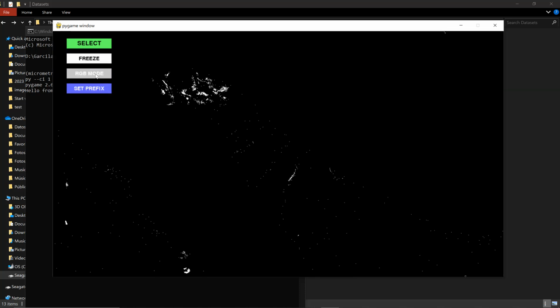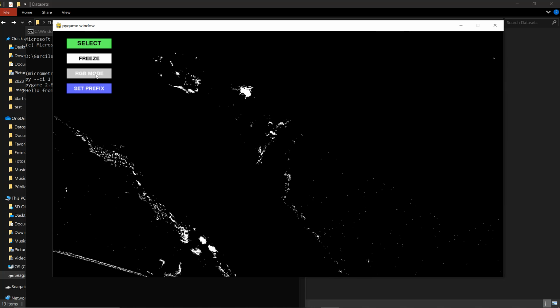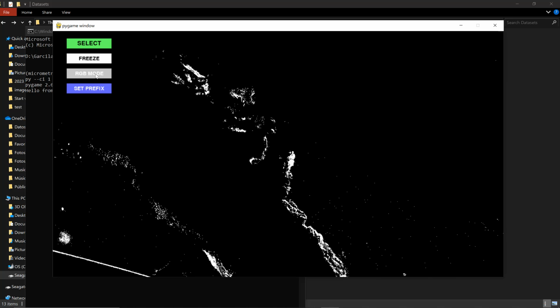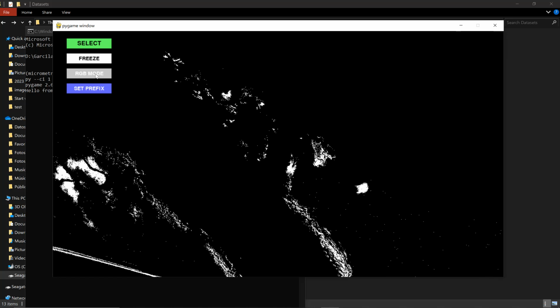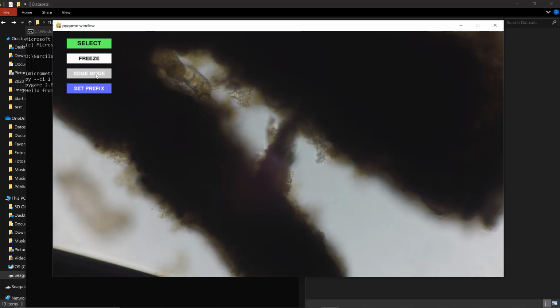And we also have the edge or motion detection parameter, which allows us to highlight the elements against the background based on a quantification or an average of pixels that reveal a static background. Regardless of how you decide to train your neural networks, whether it is with halftones, which already provides only one channel, although you would need to flatten the image, or you may save it also as a 3-channel, providing the information on the color.